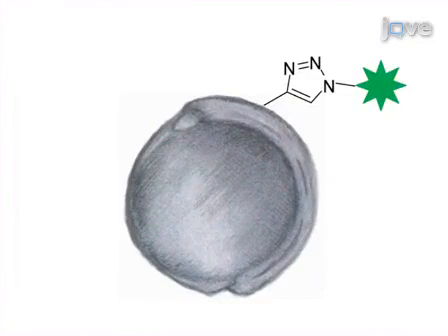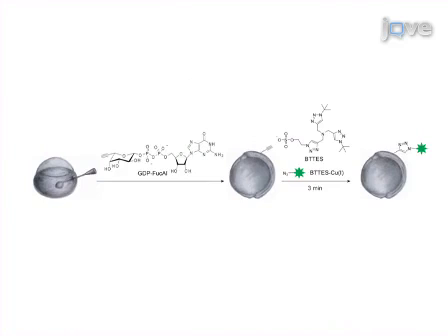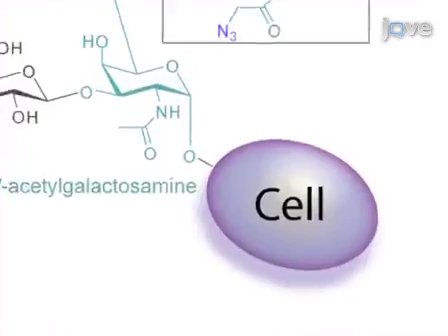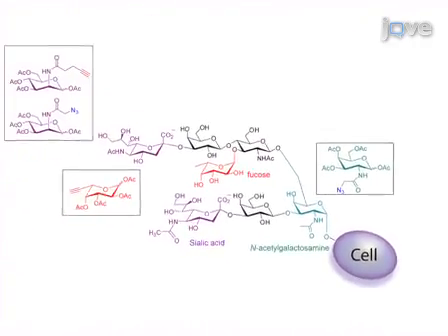and glycoproteomic analysis. This click chemistry-based method allows for the rapid, non-invasive, and robust labeling of alkyne or azide-tagged glycans in zebrafish embryos and can be readily extended to visualize other classes of glycans in developing organisms. The main advantage of this technique over existing methods, like lectin or antibody-based glycan detection methods, is that it can be applied to dynamic in vivo imaging.